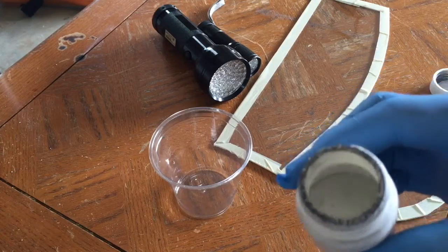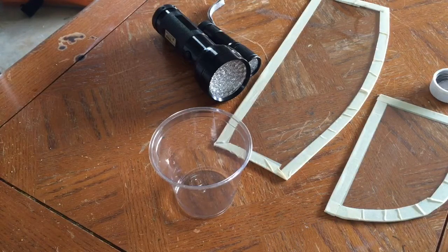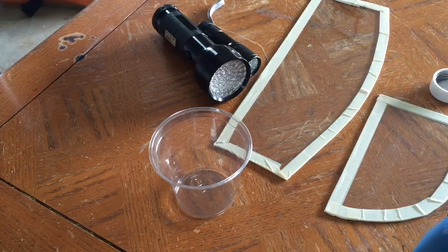Here I have some liquid gallium and I'm going to show you how to make a gallium mirror. The best way of doing that is just using a gloved hand to smear it on the glass and rub it in to form a thin layer over the glass.